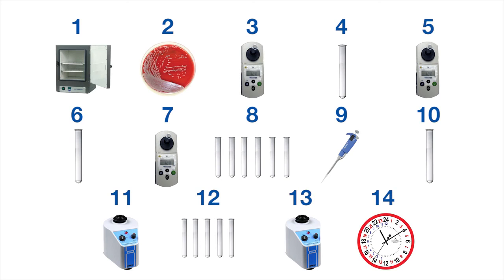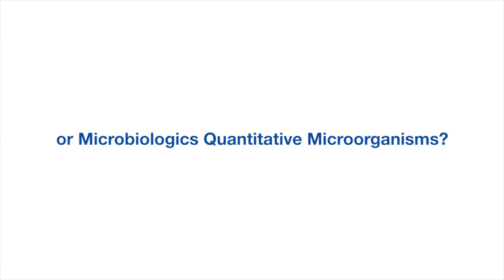So manual methods or Microbiologics quantitative QC microorganisms?